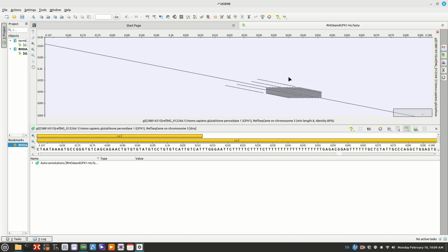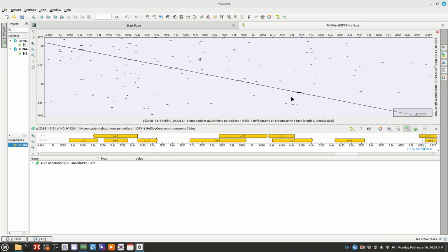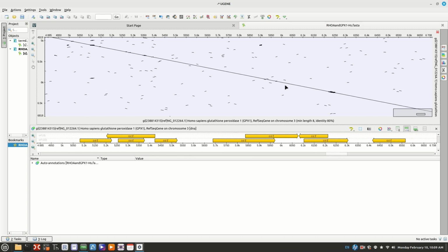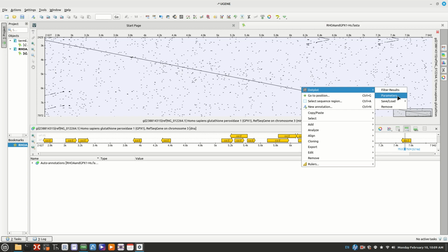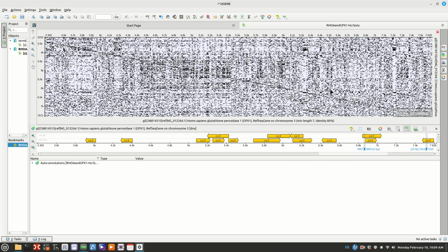So here, no, I don't see it as a terminator. The terminator could be what we want here. We want this up here. If this were up here and we got some T's, or this one was over here, or some X's, we would say it's a terminator. So we are here. I'm going to change my parameters again. We're at 8, so we want smaller, so I'm going to go 7. Like I said, I knew that would make a mess.